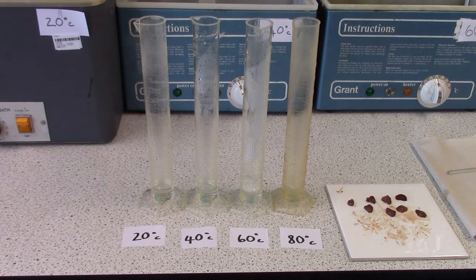In this experiment we are going to investigate whether temperature affects the activity of the enzyme catalase. The enzyme is found inside the liver tissue and we have equal sized bits of liver ready to put into hydrogen peroxide.